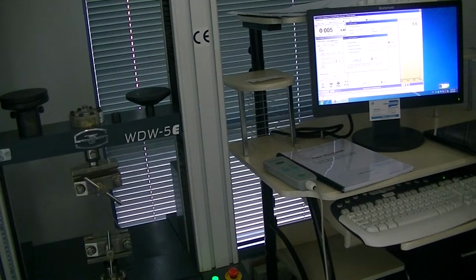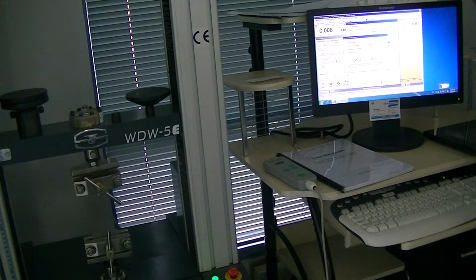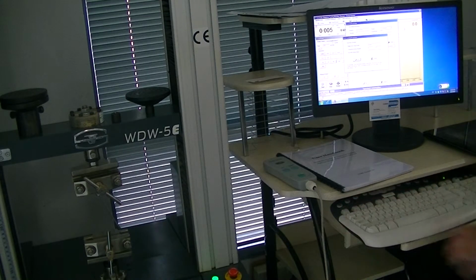Slide 6. Okay, here we have begin with string fixed. And as it says in the slide, this can be what you choose. You can write whatever you want in there. In this case, I'm going to write sample. The next step would be changing section digital, which is this section here. This must be starting with number 1 and then ending with the final batch number. In this case, I'm going to do 2 tests and I'm going to end it with number 2. Okay, so then I click OK.